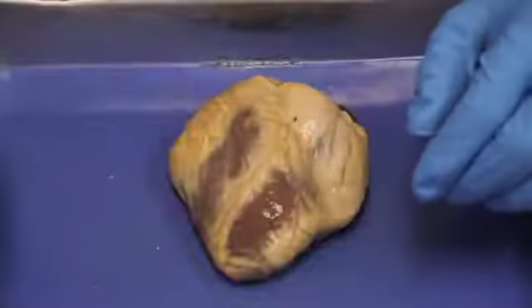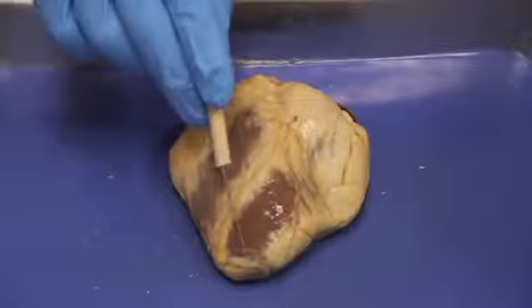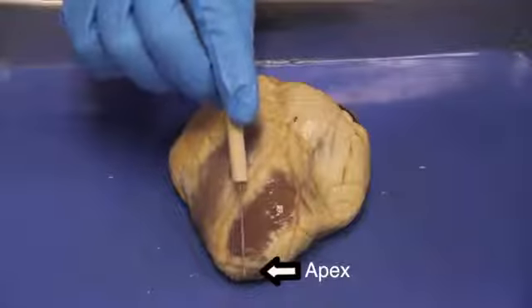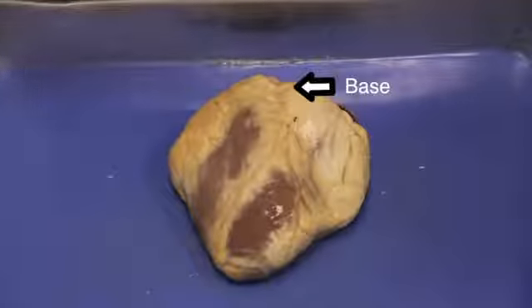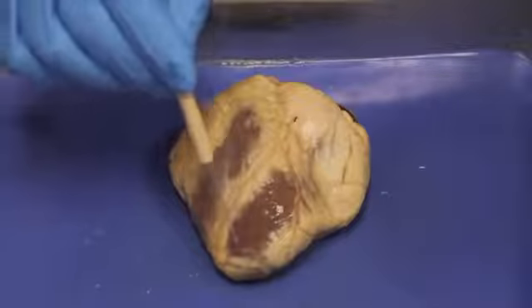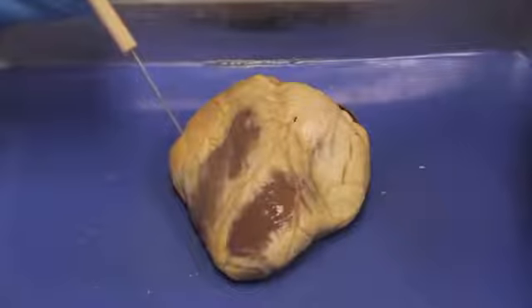The first external feature we're going to find is the apex. The apex is easy to find because it's pointed. So this is pointing down, the inferior end of the heart. The opposite side is called the base. This is where all the valves are located and all the vessels. So the larger side is the base, the smaller side is the apex. Now we need to find what is the anterior and posterior side.